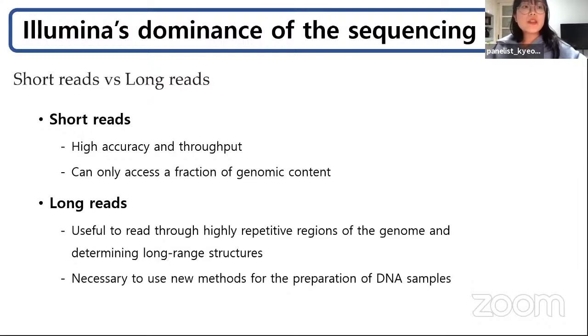So, short reads alone are insufficient in a number of applications, such as reading through highly repetitive regions of the genome and determining long-range structures. However, to get the most out of these long-read platforms, it is necessary to use new methods for the preparation of DNA samples.